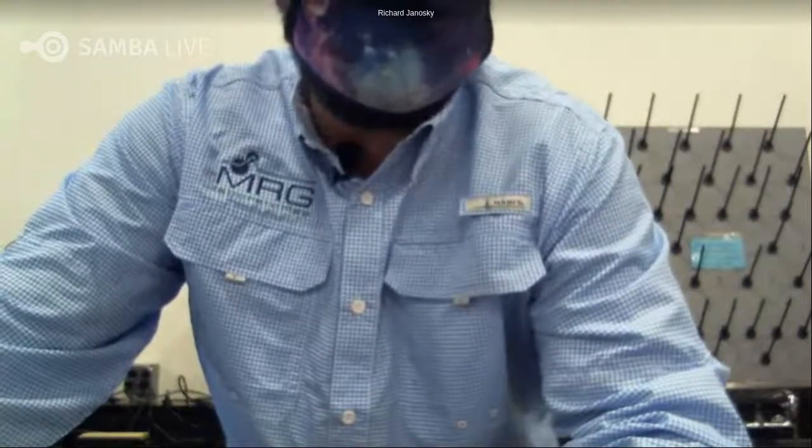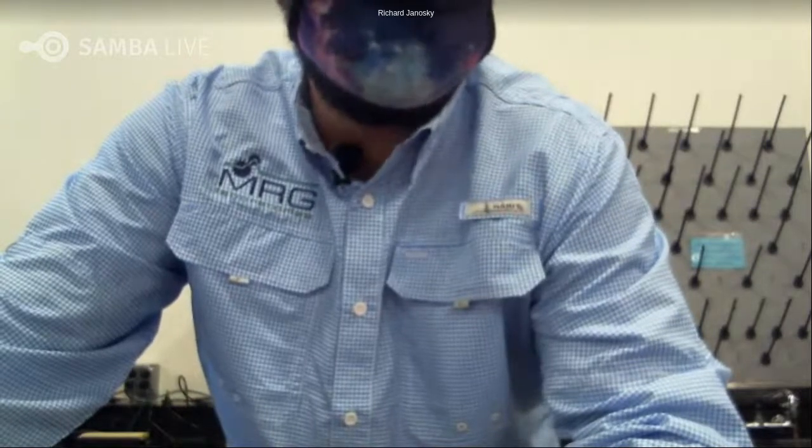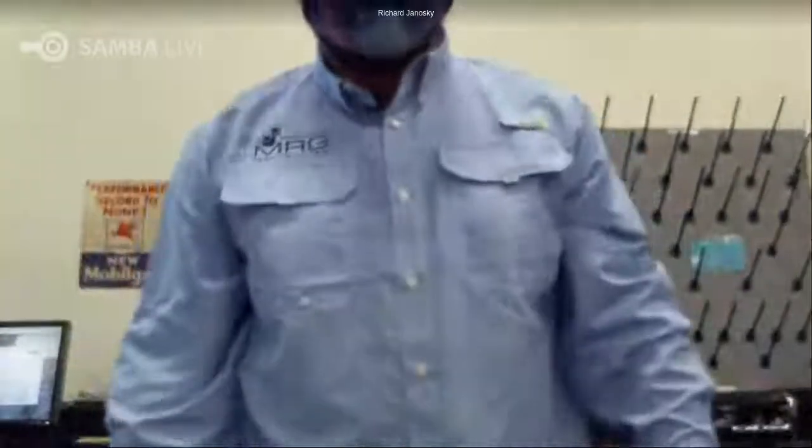Using a different grease with the same NLGI grade would not be preferred, but it would be better than no reference grease at all. Greases with different formulations but similar thickeners might not give the same results on die extrusions, so the baseline would not be the best. It wouldn't be representative.